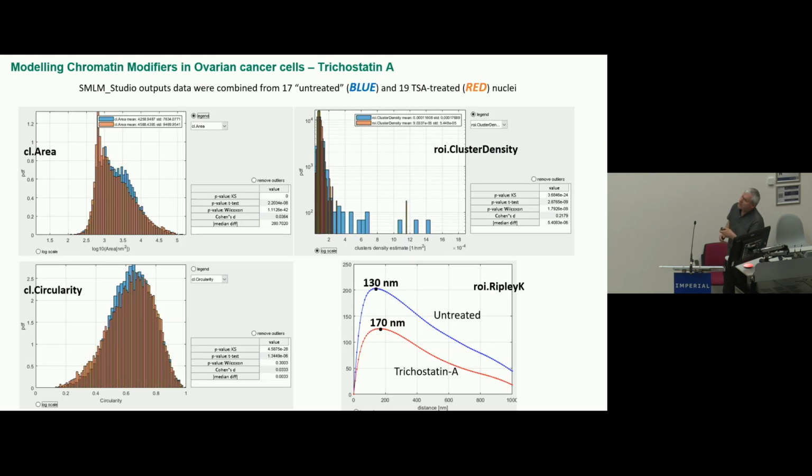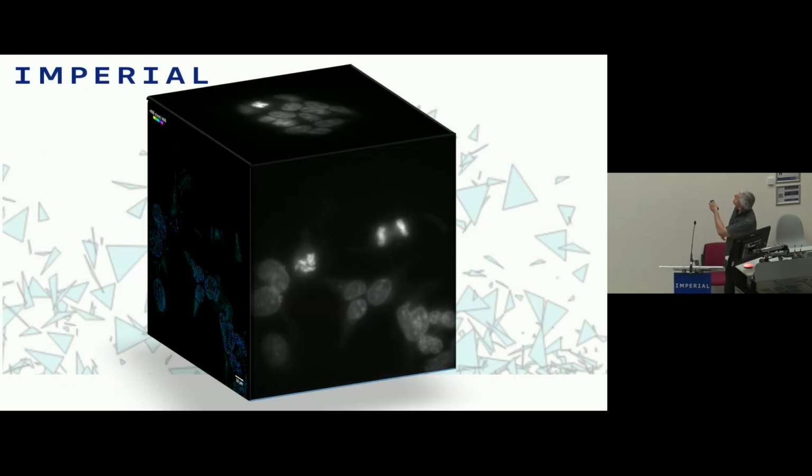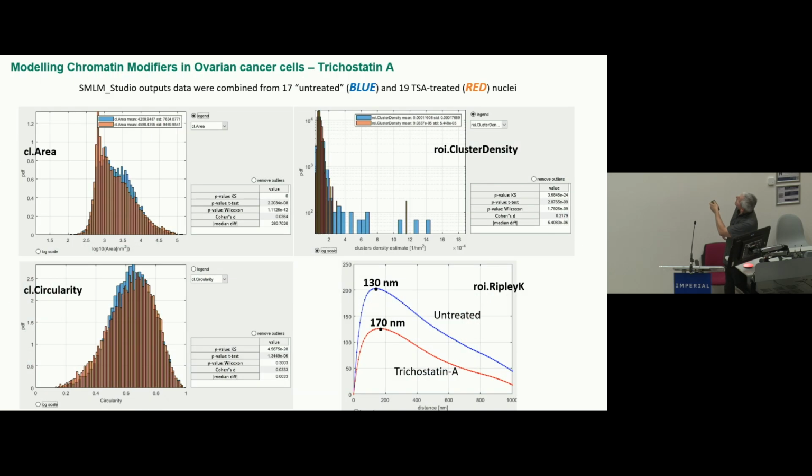In this point pattern analysis, you can apply Ripley's K, probably one of the oldest algorithms to study point pattern distribution. I want to draw your attention to this.